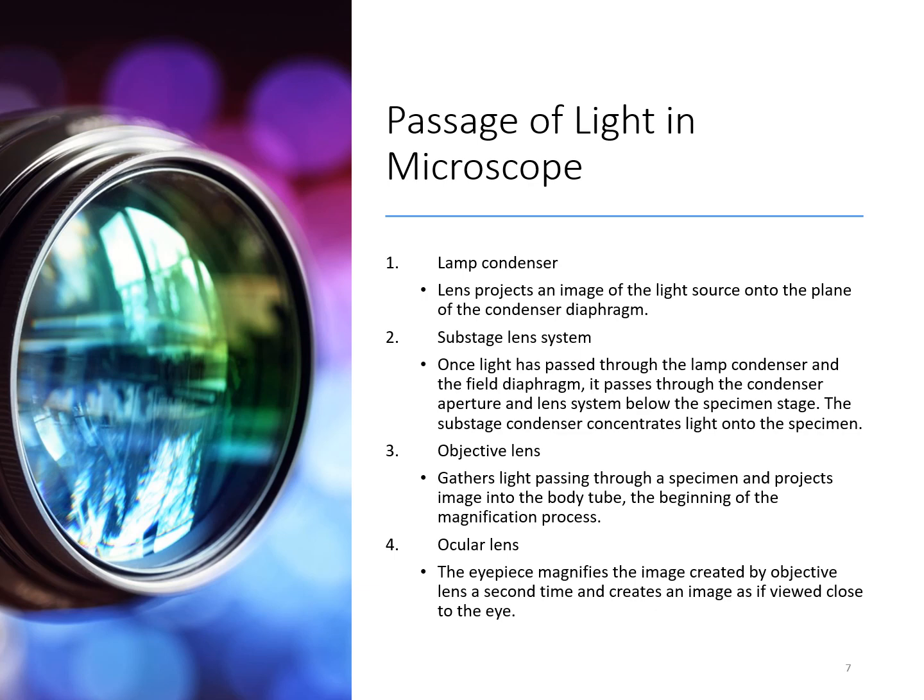And then of course above your specimen you have your objective lenses, and your light source is going to pass through those. And that's going to allow that light to reflect through and around whatever cellular component, or in the case of like a urine sample, it could be a crystal or something like that. And so as it passes around or through that actual slide, then it will come up through your objective lenses, and then it'll come through your ocular lenses, which also has a magnification in it. So you're getting magnification on top of magnification, and then of course you can visualize it with your eyes.